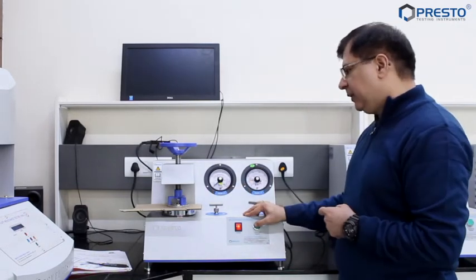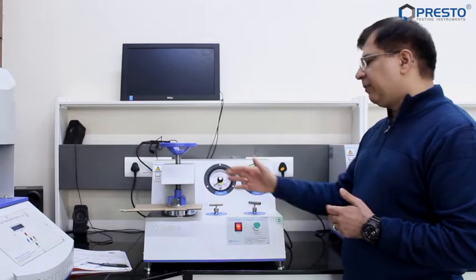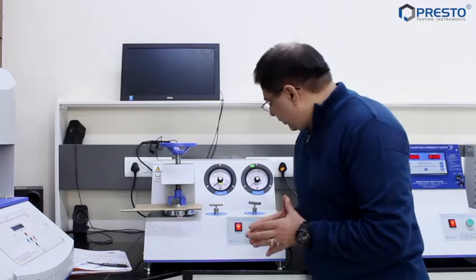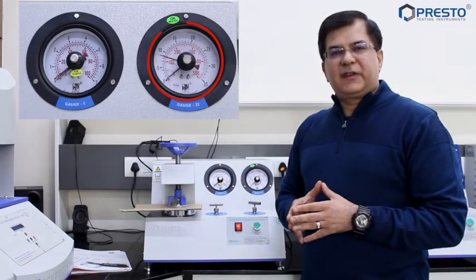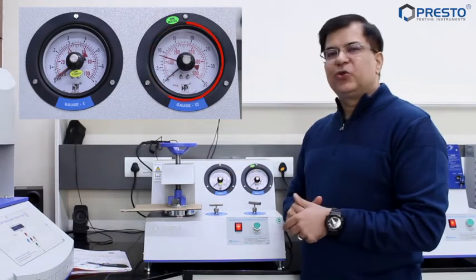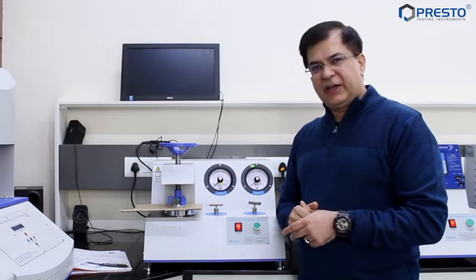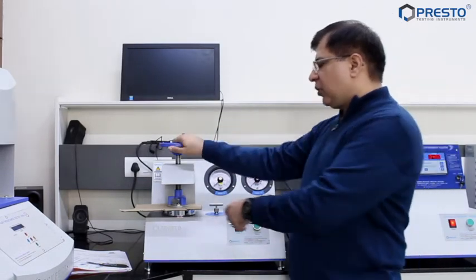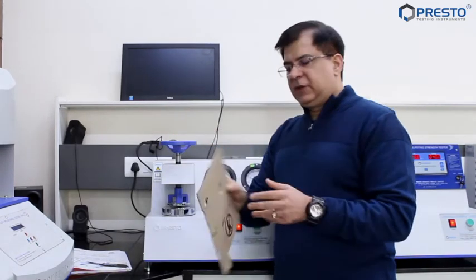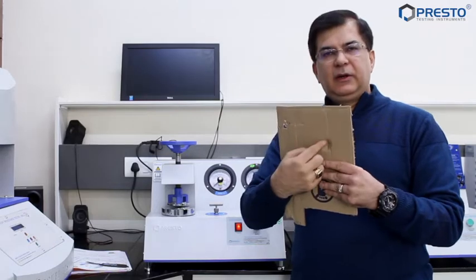If you see over here, the bursting happens — and there it is. The reading is showing as 8 kg per centimeter square. So you can well imagine: if I had used the 0 to 7 kg per centimeter square gauge, we would have crossed the limit and not got the right results. This has been the bursting which has occurred.